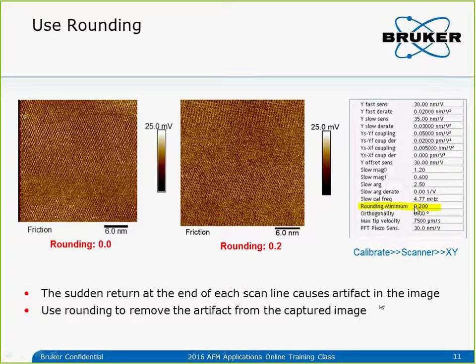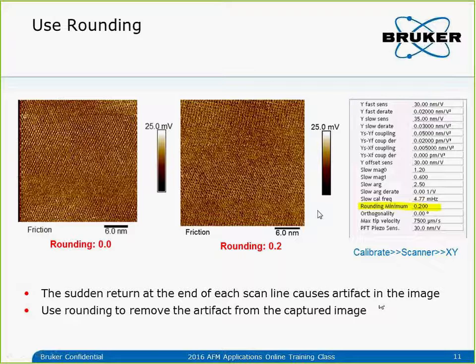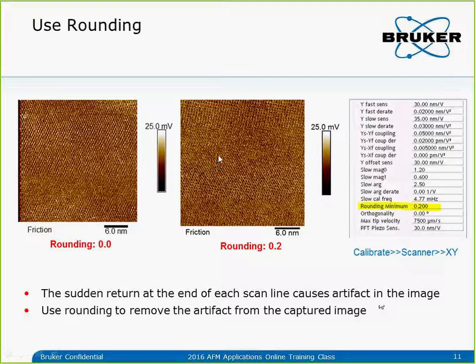Comparing the two images — same area, same 30 nanometer scan size — the only difference is that on the left I didn't apply any rounding, and on the right I applied 0.2 rounding. With rounding, there are no edge artifacts. To control drift, one thing I want to mention is do not use double-sided tape to mount the sample — it tends to introduce a lot of drift. Use silk glue or epoxy to mount it firmly.